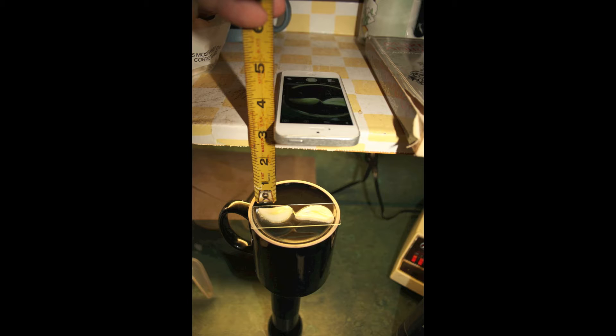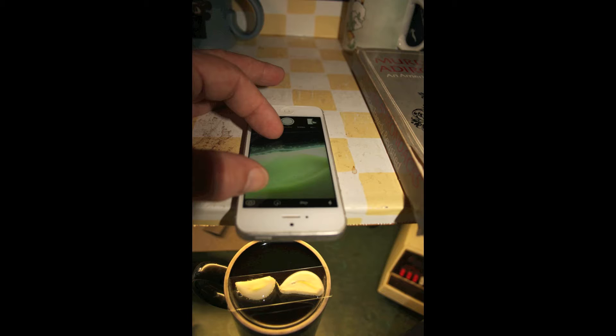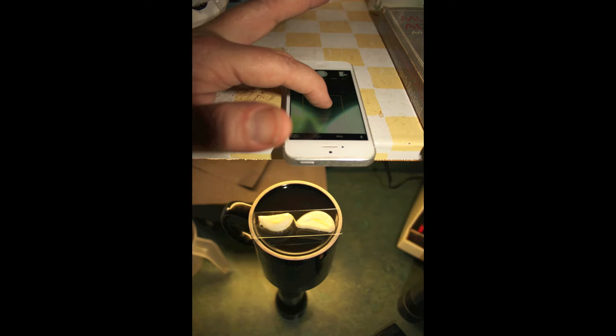It gives you a better idea about how far away it needs to be. This is an iPhone 5, by the way. This is movie footage from the view of the iPhone — it's not zoomed in yet, of the slide. The light in this case is below. You just use the touch screen to zoom in, then you want to move things around so you're looking at a dark part of the frame. Then you basically press on the touch screen, hold it down, and it locks in on that focus and on that exposure.